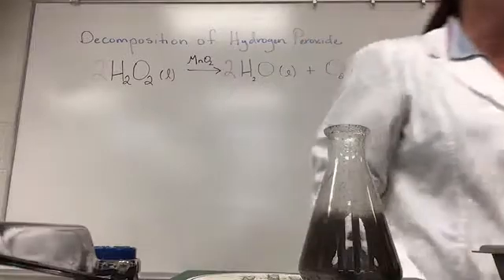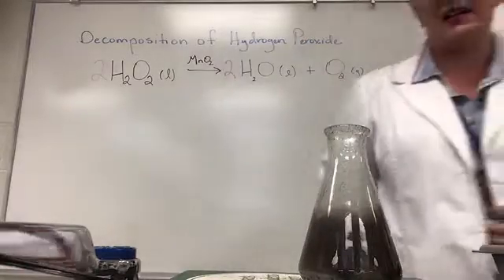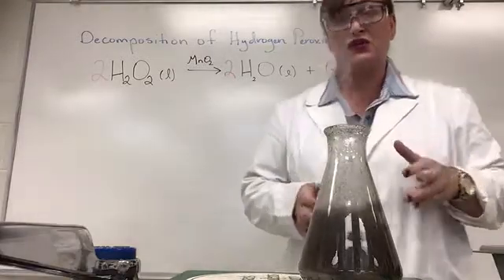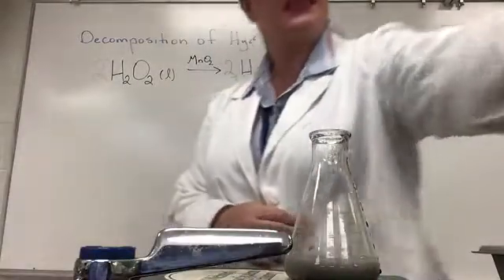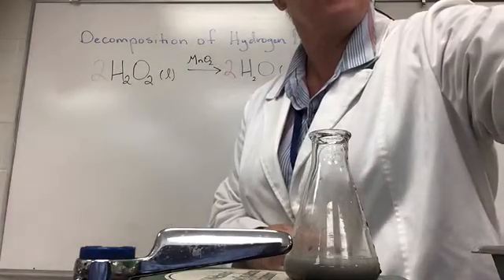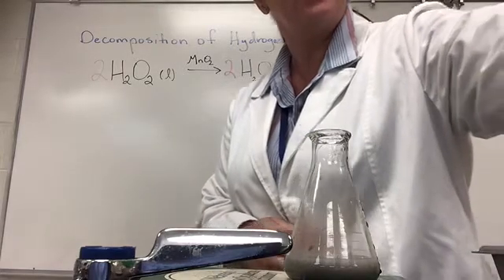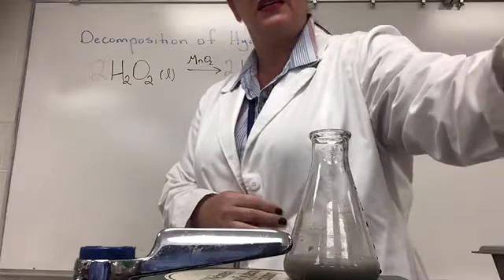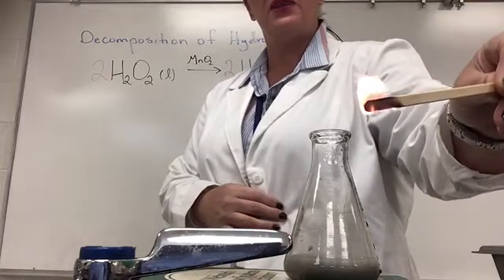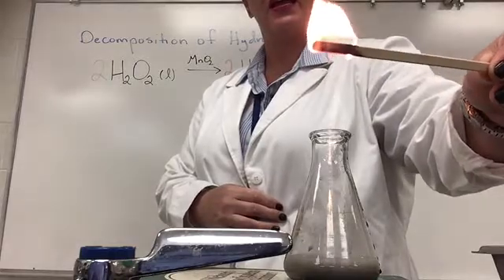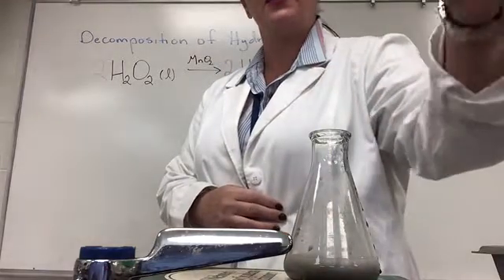Now just for fun, I want to show you guys that this really does have oxygen gas being produced. Calm down just a little bit, and we are going to test for the presence of that oxygen gas. And this is another one of the flame tests. So here I have a burning wood splint. I'm going to get that nice and burning. And to test for oxygen gas, I'm actually going to put it out.